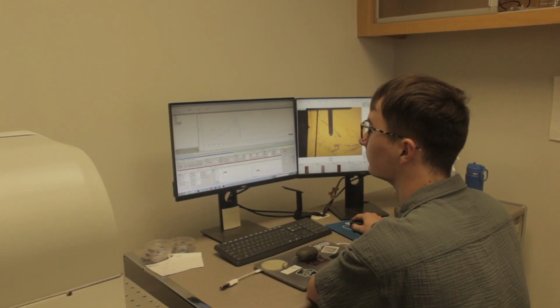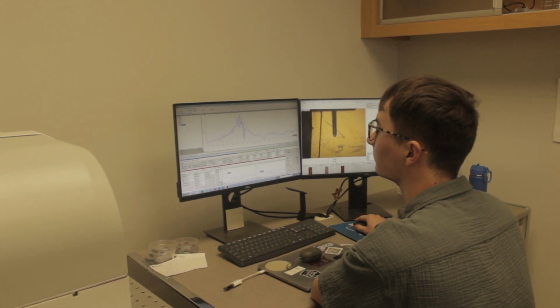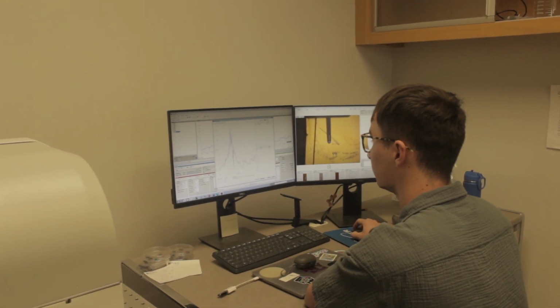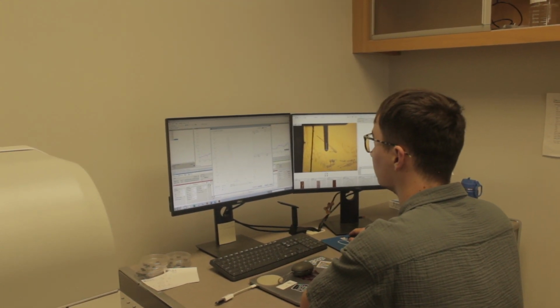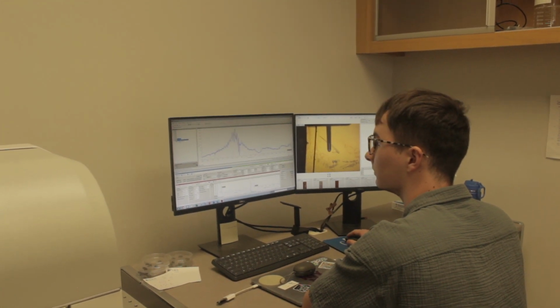Amyloid protein aggregation is a very heterogeneous and complicated process. Utilizing nano-IR, we can do single particle analysis, so we can know the structure of oligomers and fibrils, and we will link the structure with their cellular damage. Our research can provide insight into which lipid biosynthesis pathway to target in resolving neurodegenerative disease.